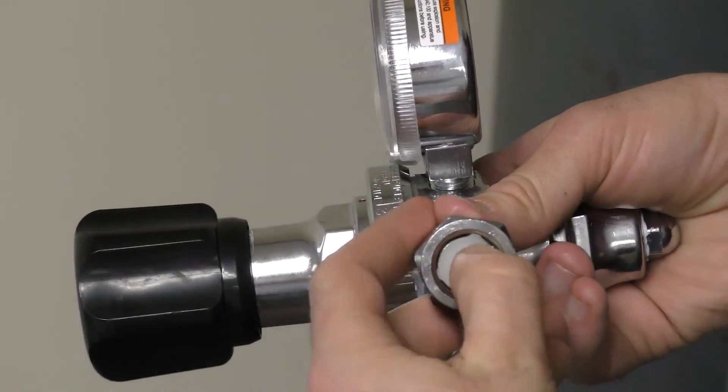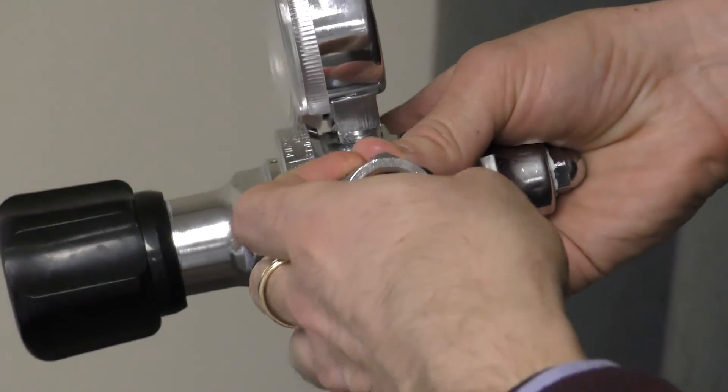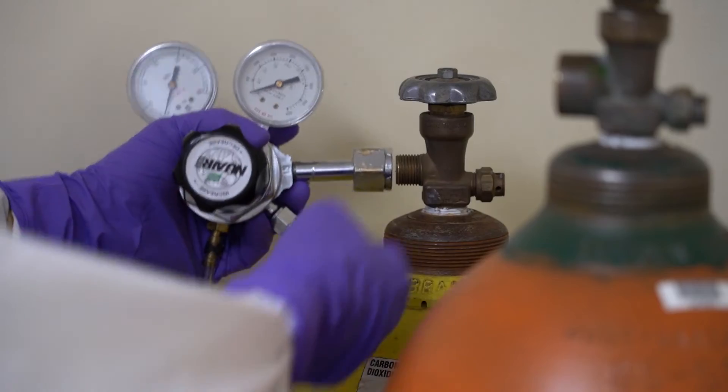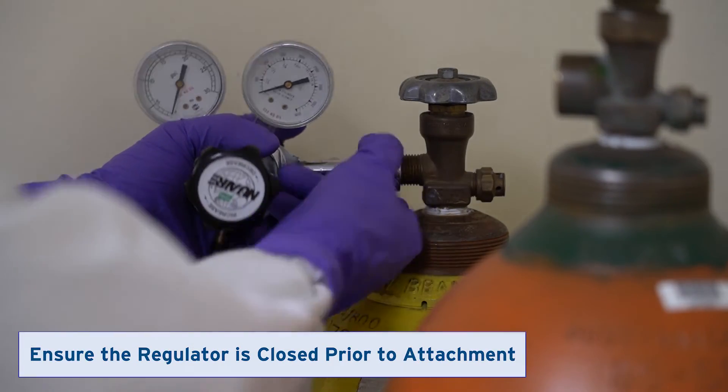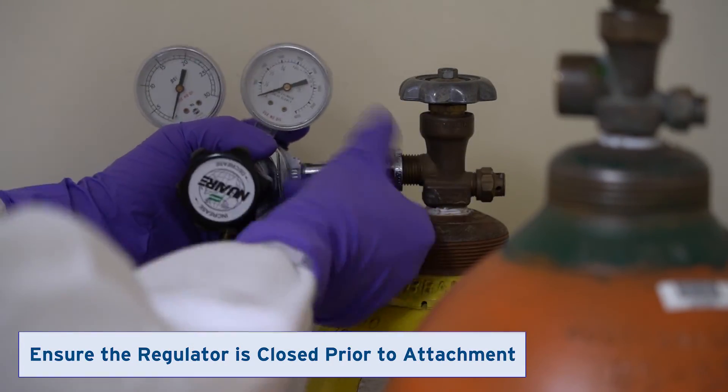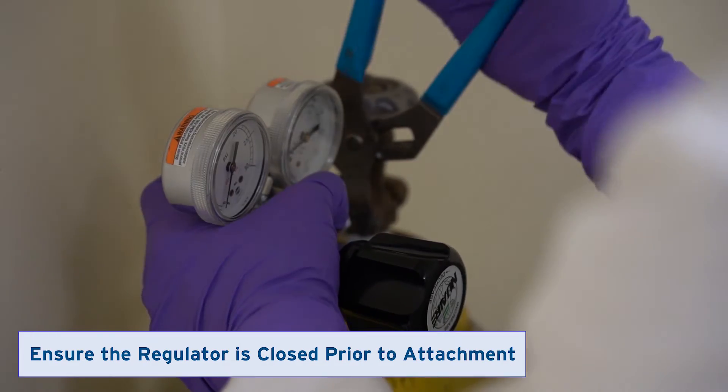Place the disc seal included with the CO2 regulator. Attach the CO2 regulator to the CO2 tank with a wrench.